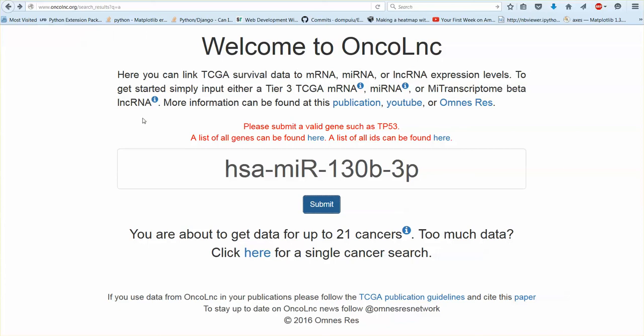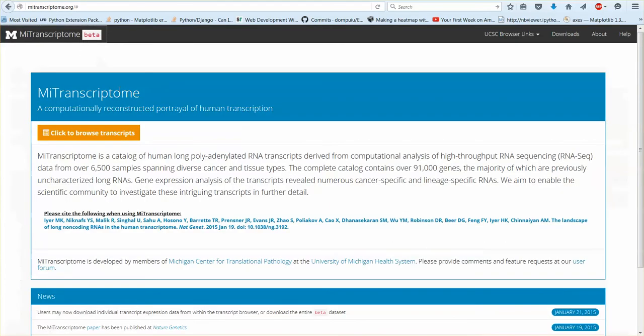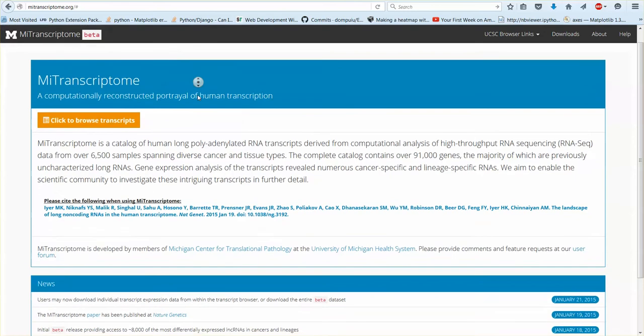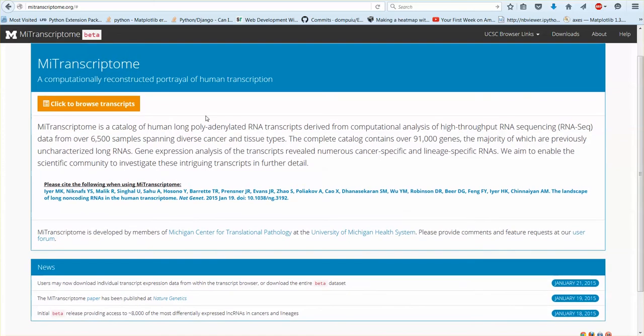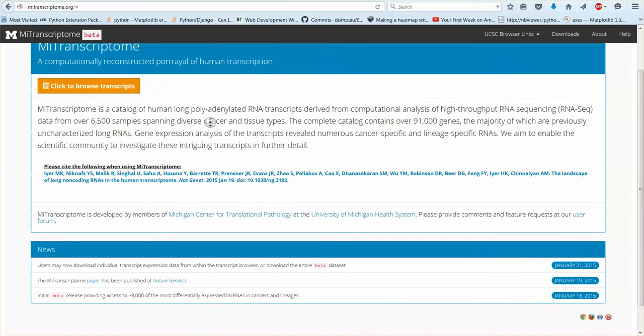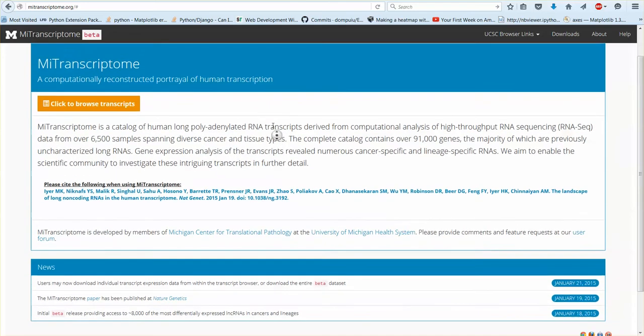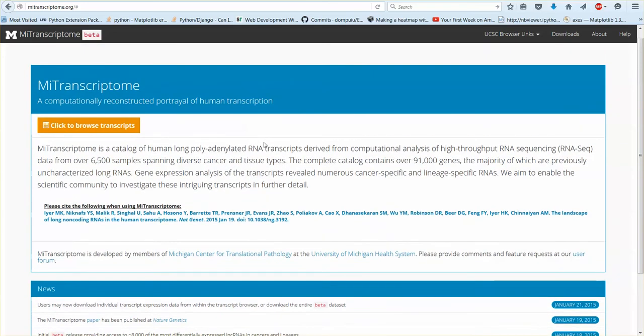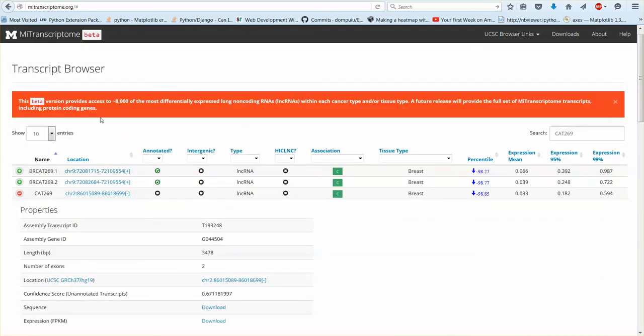Okay so what about MiTranscriptome beta long non-coding RNAs? What are those? So this paper came out about a year ago and they made this data portal and it has about, they've only released the beta data set but it has about 8,000 of the most differentially expressed long non-coding RNAs. So I was looking at this one. So let's go ahead take a look at that.